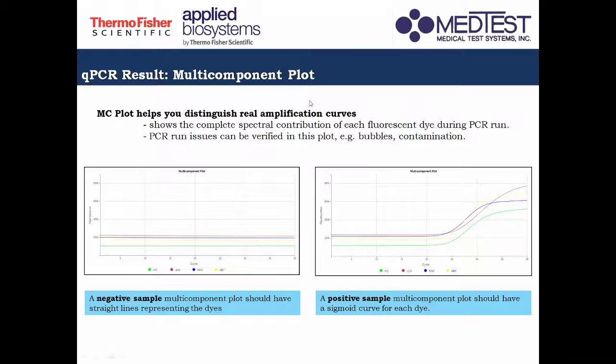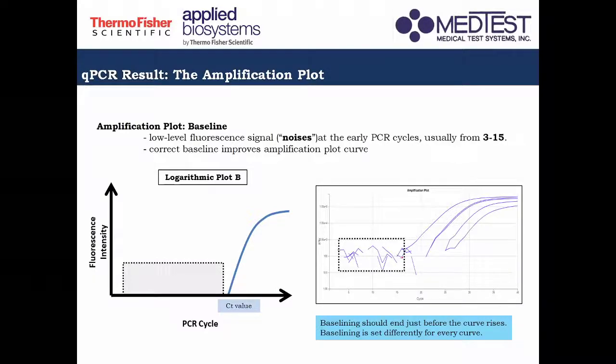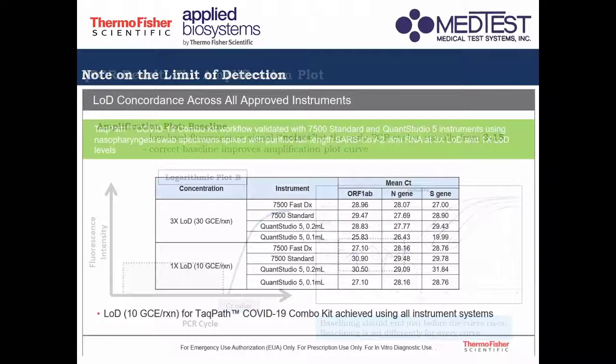So, any questions pa po? So I will also share with you my presentation today so that, at least bago tayong magkita-kita by next week, you can review the qPCR plots that is important for data analysis.